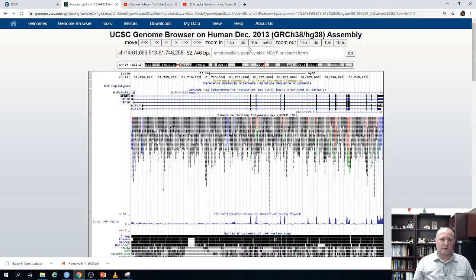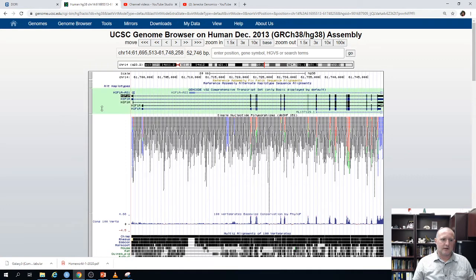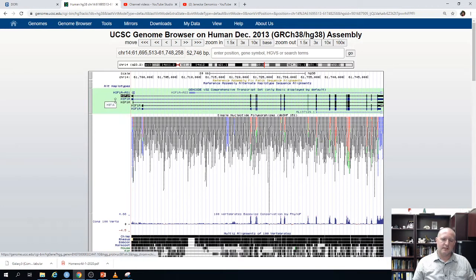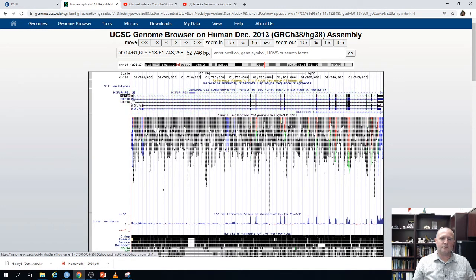Below the coordinates we have the alternate haplotypes track. Let's focus on some specific interesting ones. This track I just highlighted is the genome annotation track for the GenCode version 32 dataset. It has all the genes that have been annotated — their positions defined from start to end, all exon positions, and the untranslated regions. Notice there are multiple gene annotations, or gene models, for the gene HIF1-alpha.